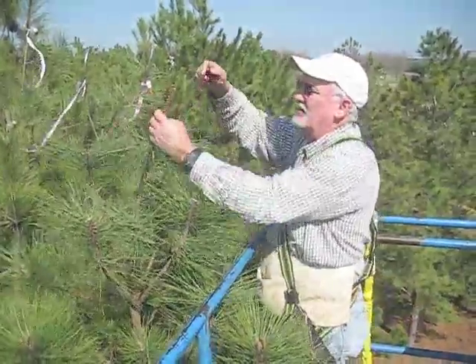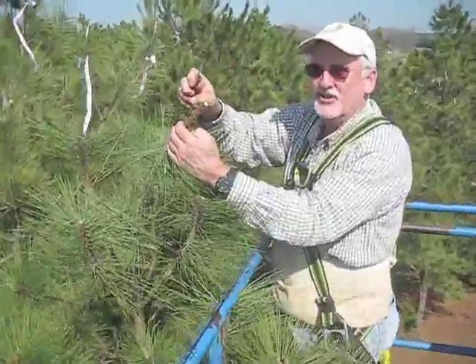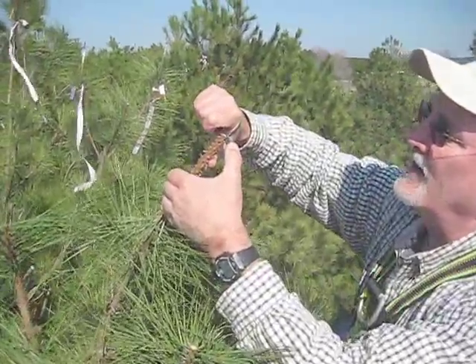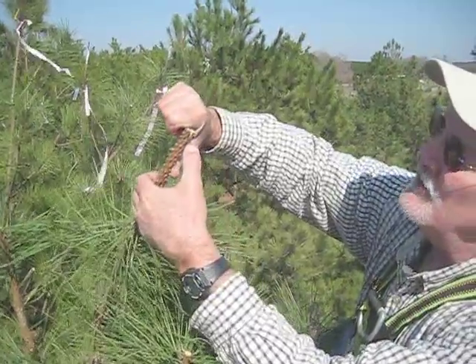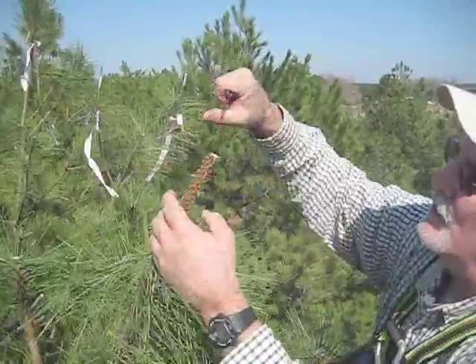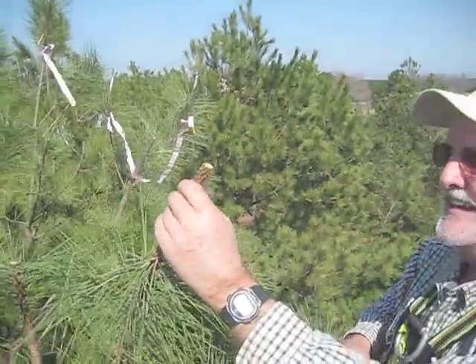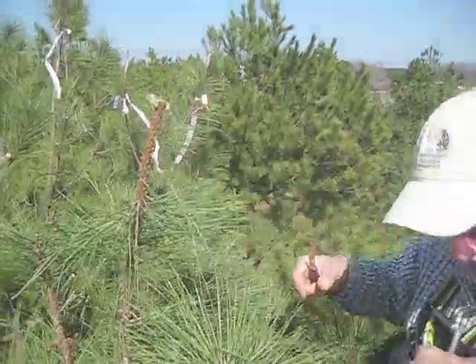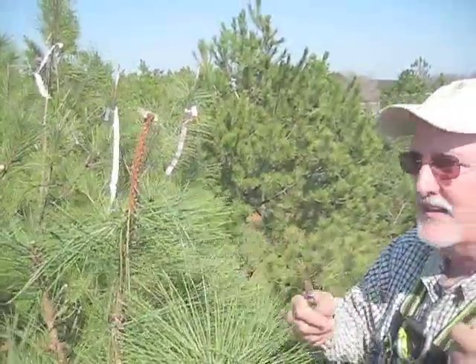Now I'm going to take my grafting knife — very sharp, surgically sharp, shaving sharp. You'll see what I'm doing: I'm cutting right down to the middle of the rootstock, or actually the interstock as we call it. Then I put on a clothespin to keep it shut — to prevent desiccation.